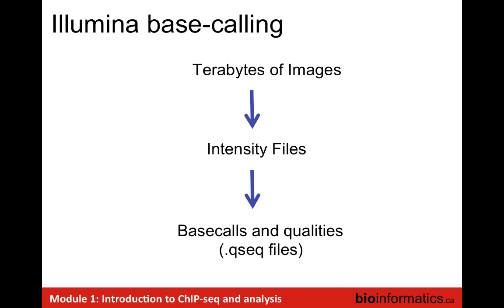Okay, so very briefly, this is what happens behind the scenes. Lots of images are generated. These are converted into intensity files.